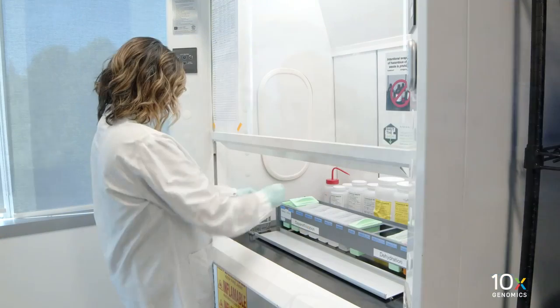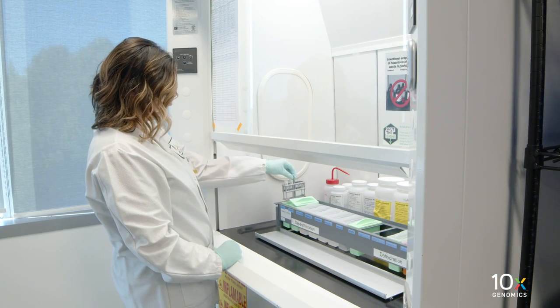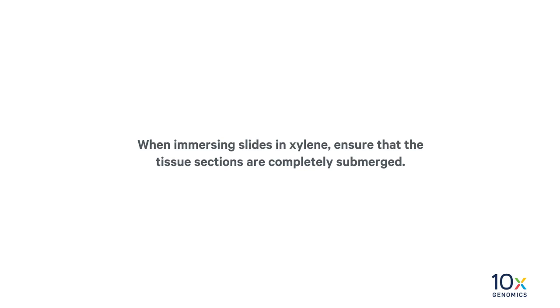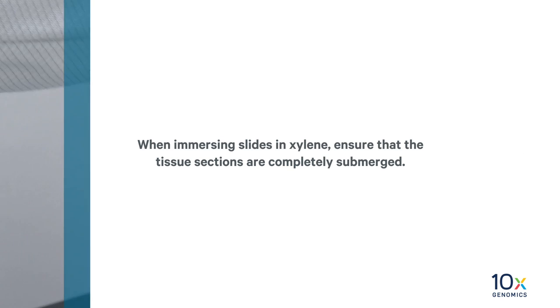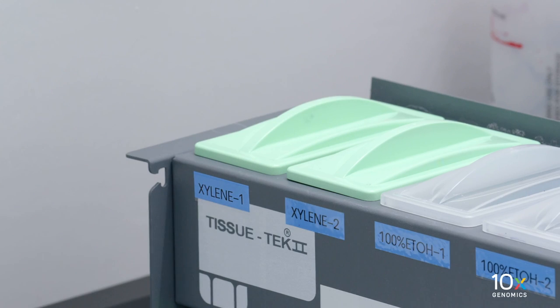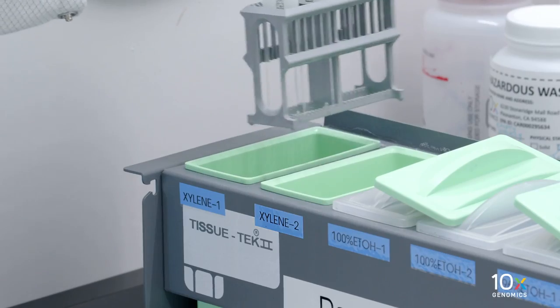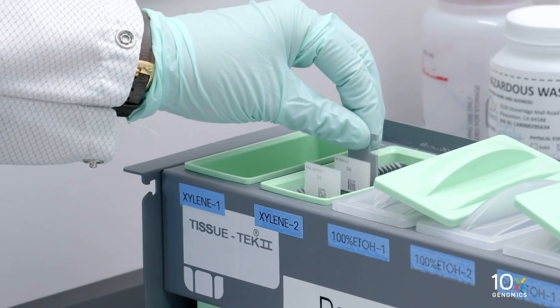Next, we will immerse the slides in xylene. Gently immerse the slides in Xylene Staining Dish 1. When immersing slides in xylene, ensure that the tissue sections are completely submerged. Secure the cap to prevent xylene loss. Incubate for 10 minutes. Gently immerse the slides in Xylene Staining Dish 2 and incubate for 10 minutes.